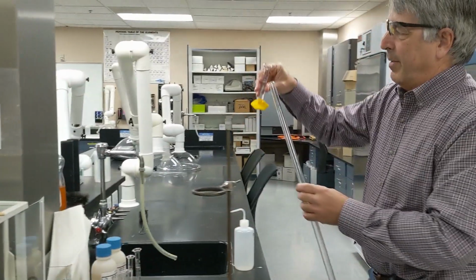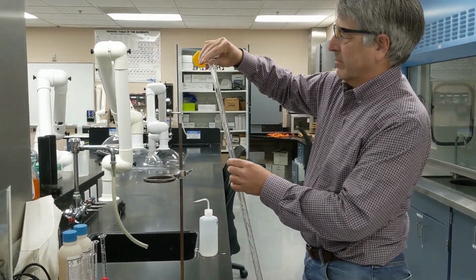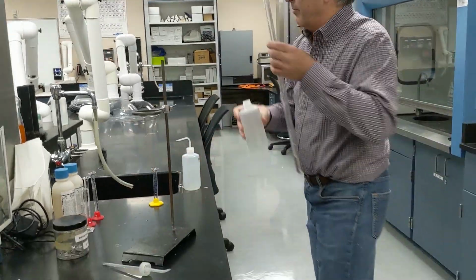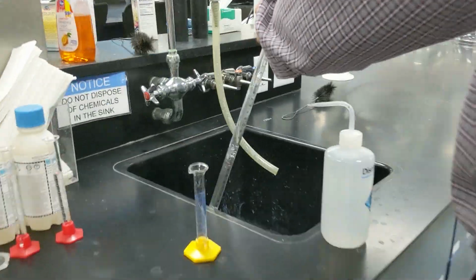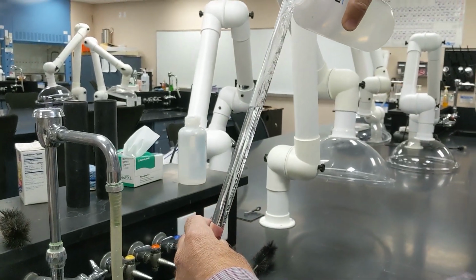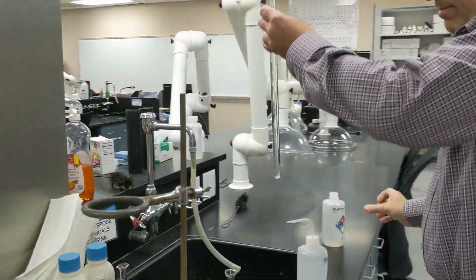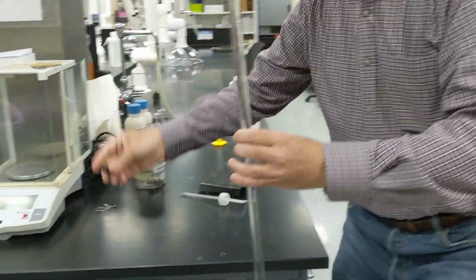Right? And now to prepare the eudiometer, I'm going to first add about 8.5 mL of concentrated hydrochloric acid. And then I'm going to fill this all the way up with distilled water. So most of the concentrated hydrochloric acid is on the bottom, and above that we're going to have water. And now let's put this stopper in here.